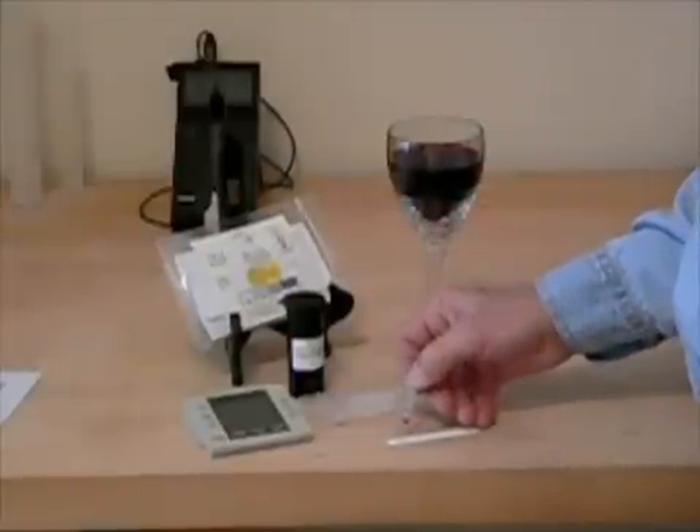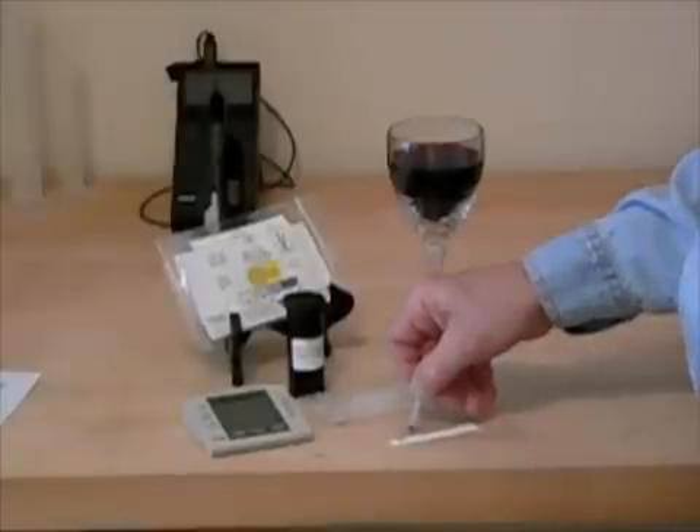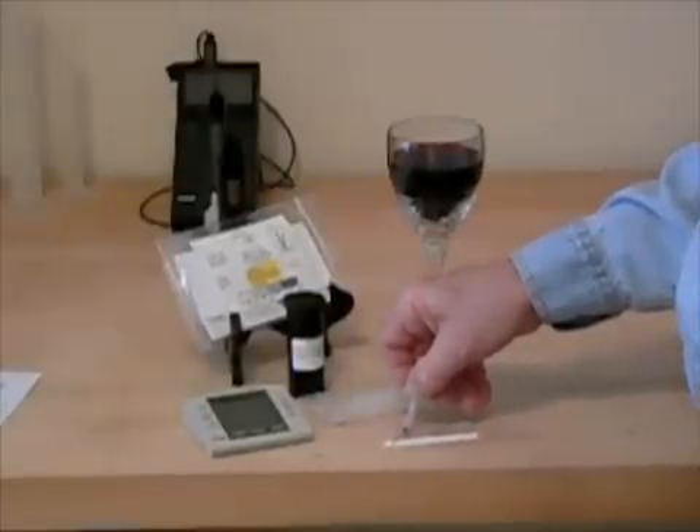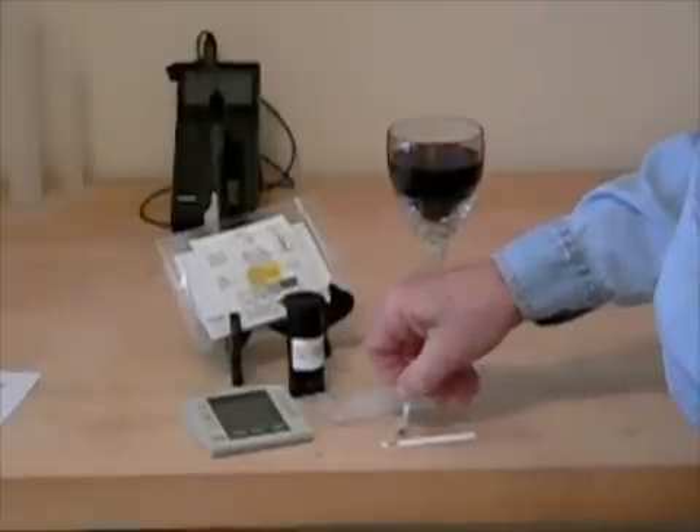When you apply the sample, put the tip of the sampler onto the absorbent pad on the back of the test strip. Apply a slight pressure to make sure that all the layers are wetted evenly and then squeeze the top bulb.